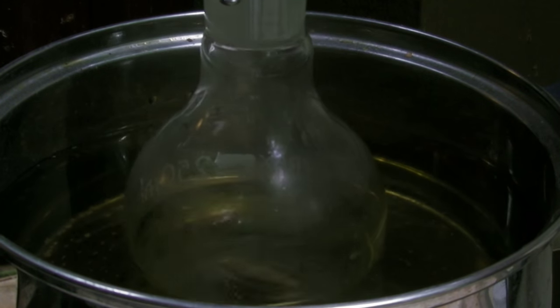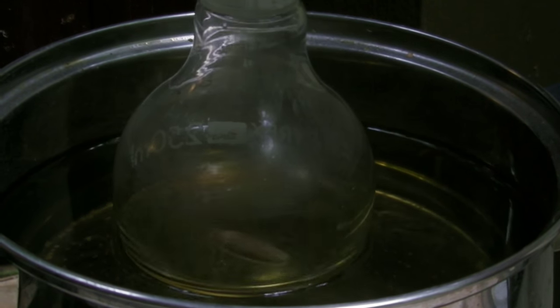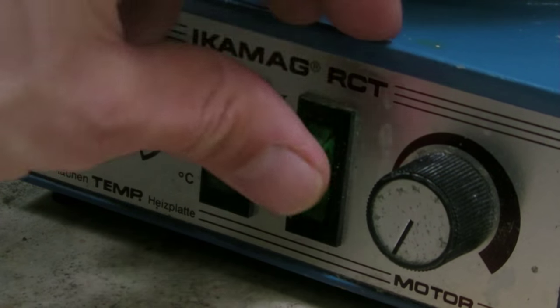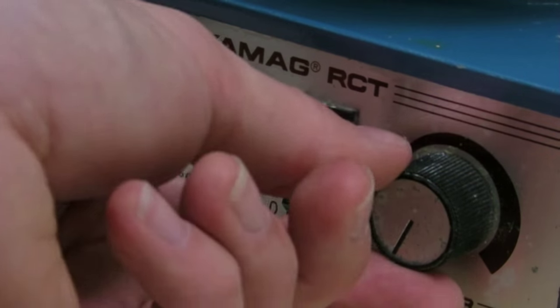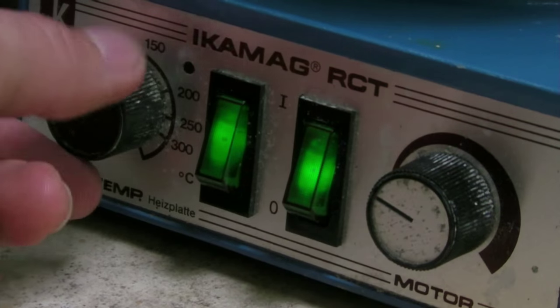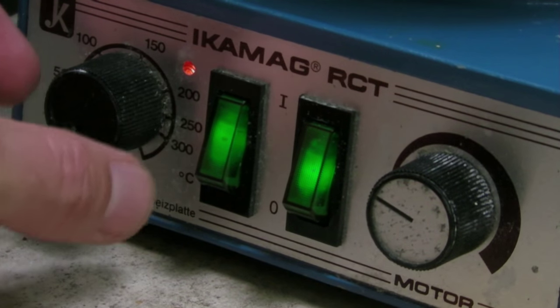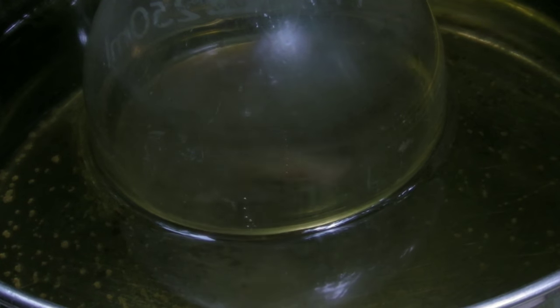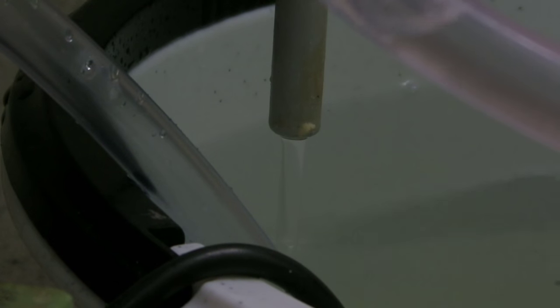Especially when distilling benzaldehyde, a stirring bar is very important because it is likely to bump. The use of a Vigreux column is recommended but not needed when the stirring is strong enough. At the beginning, the hot plate can be set to maximum so the heating of the oil bath is faster. The pump should only be started when the stir bar is already moving.